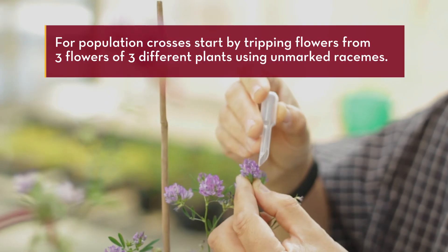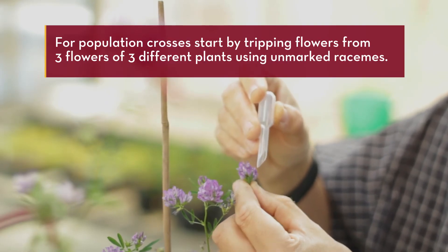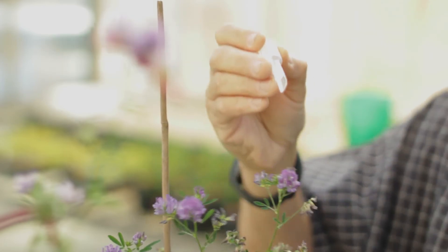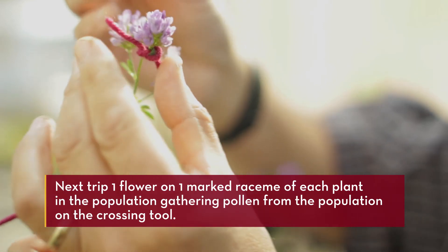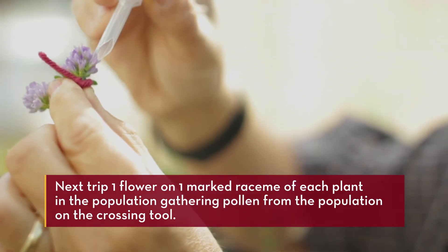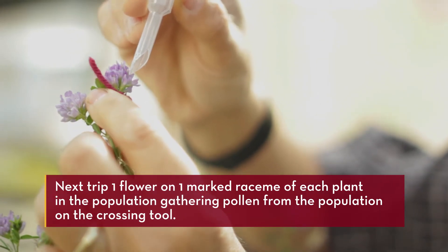To make a population cross, start by tripping flowers from three flowers of different plants using unmarked racemes to gather enough pollen. Then trip one flower on one marked raceme of each plant in the population, gathering pollen from the population on the crossing tool.